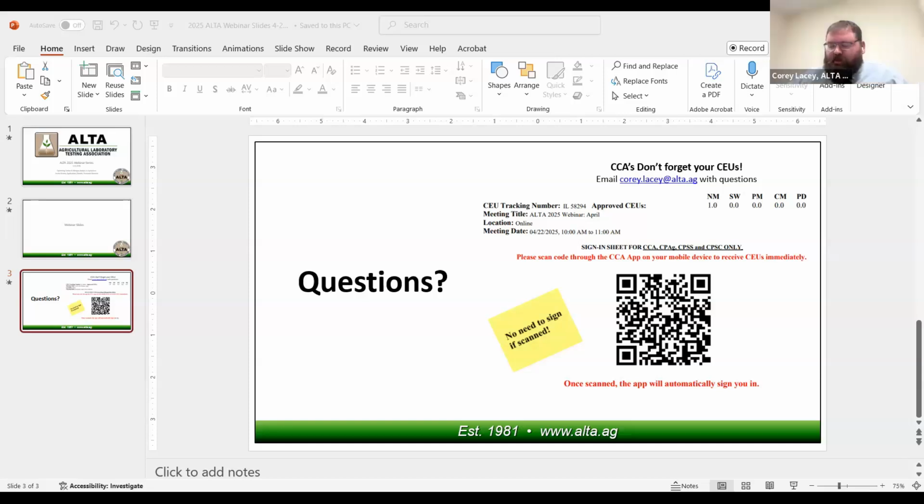Another big topic that you hinted at already is the cost of helium challenge in labs, and the switch to argon. I know you mentioned specifically that there's some loss in sensitivity on nitrogen on the lower range. I'm not sure specifically with Elementar instruments, but maybe broadly with combustion instruments, there's a change in maintenance requirements and the speed at which consumables get used and things like that. What are some broad challenges that labs face when they're making that argon shift? Can you comment a little bit more on that?